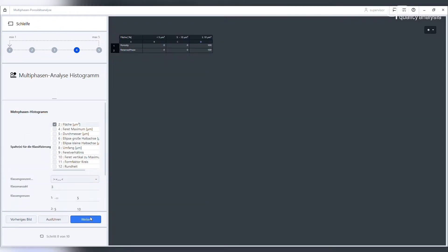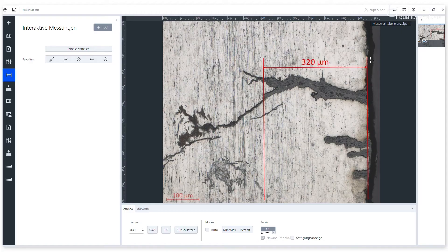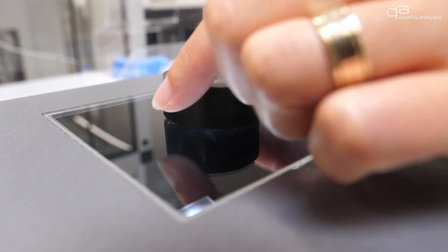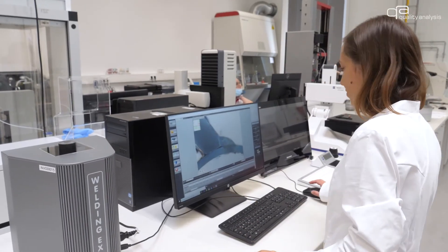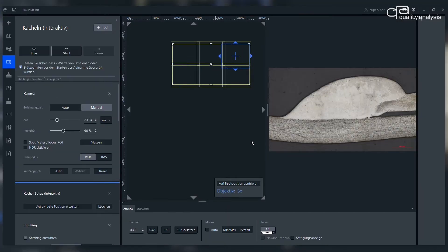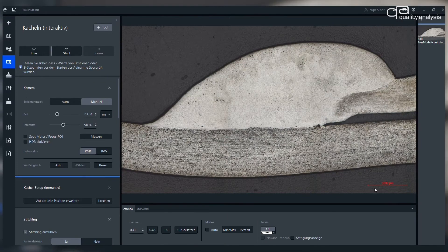We also routinely perform qualitative and quantitative evaluation of porosities and determination of corrosion types and corrosion attack depths. Additionally, we are also specialized in the testing of soldered and welded joints with regard to their geometric evaluation according to relevant standards or customer specifications. The change in the microstructure due to the heat input is also examined and characterized.